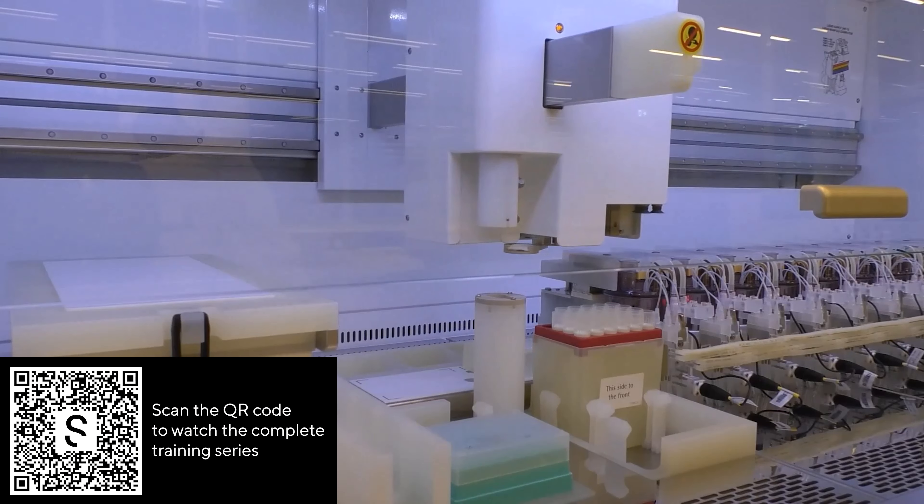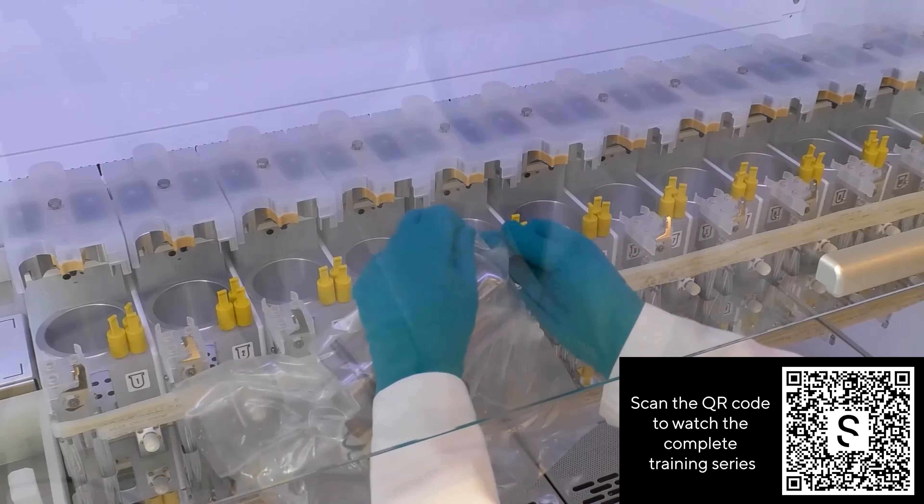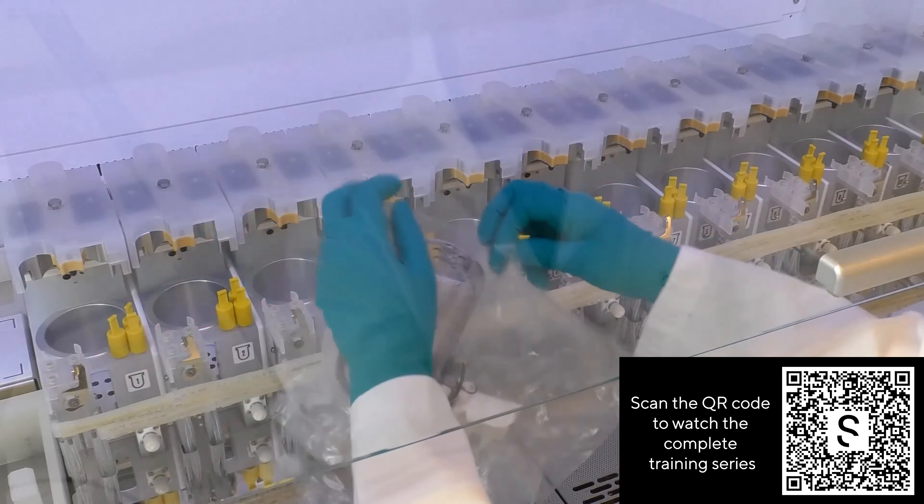Do you want to learn more about how to use your Ambr 250 high throughput system? In this video tutorial you'll learn how to operate the Ambr 250 high throughput system.